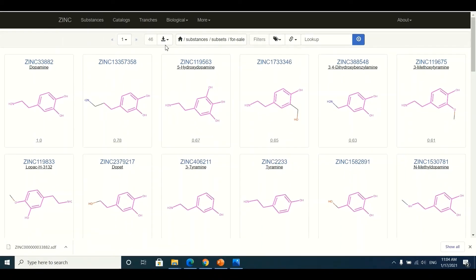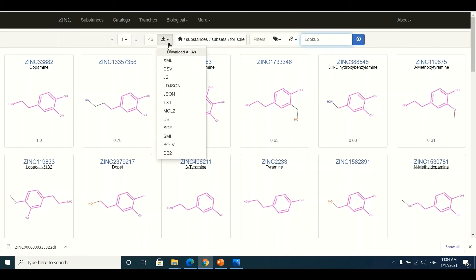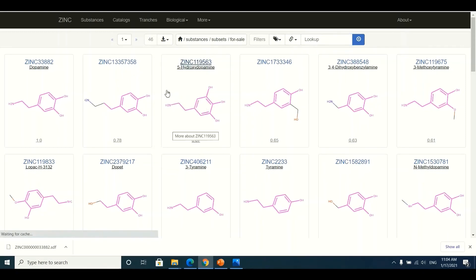To download all of these commercially available structures for virtual screening, I click the download button, select SDF format, and all of these structures will be downloaded to my system and will be available for virtual screening.